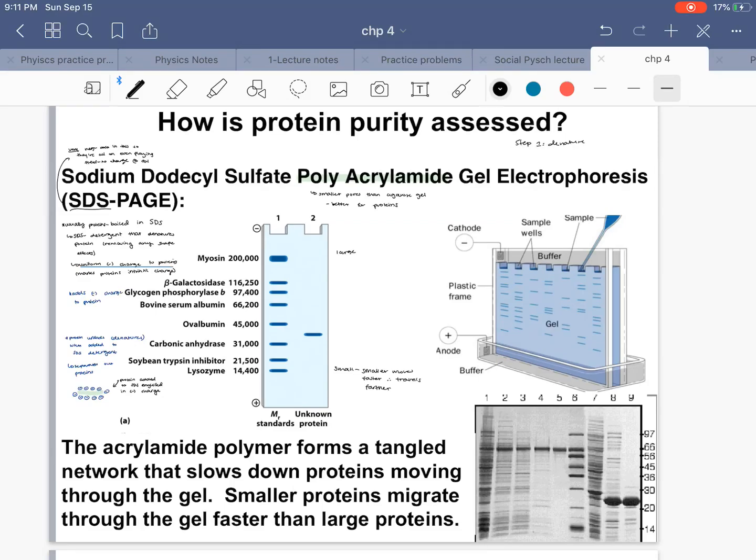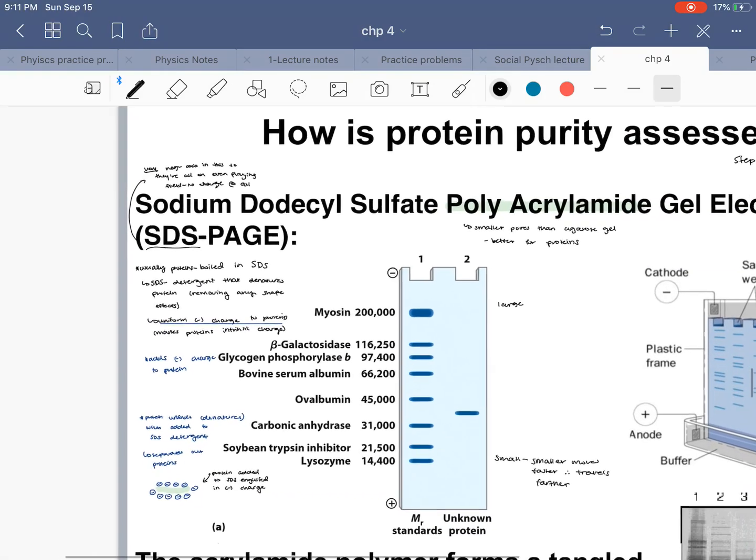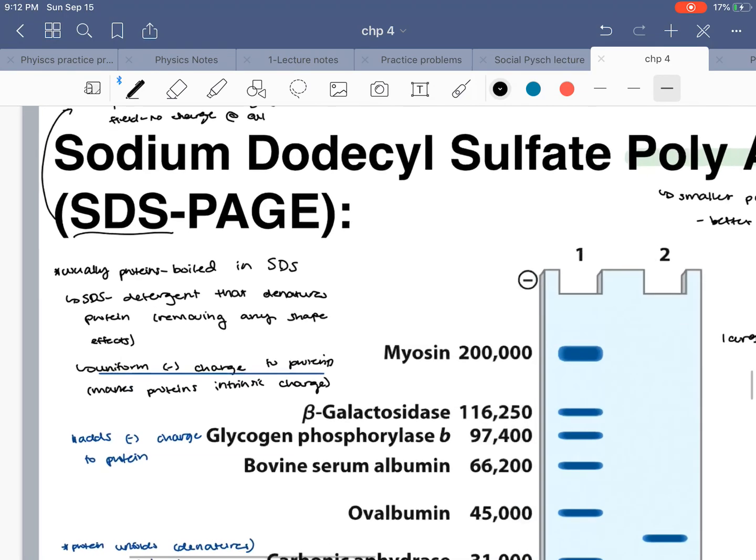All right, so this technique that we're analyzing here is called SDS. It's a specific type of gel electrophoresis that we're going to use on proteins. So the first step for doing an SDS gel electrophoresis is that we want to denature our proteins. It's not going to be very helpful if we have our entire protein sequence all jumbled up together, because we won't be able to look at each individual protein, which is kind of the whole point of running this thing.